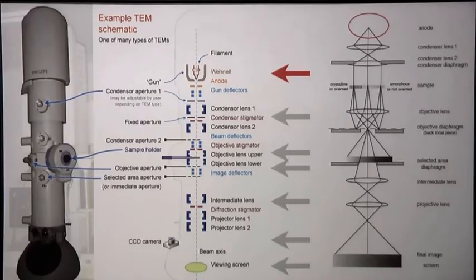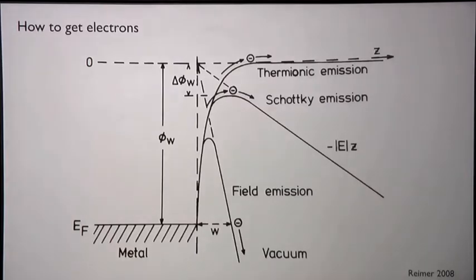So, okay, that brief aside, let's talk about the source. There are really two and a half kinds of sources in an electron microscope. The vocabulary, you talk about three different kinds: field emission, Schottky emission, and thermionic emission. But really, there's a continuum between these three. I'm going to explain each of them in detail. So the thermal emission sources are created by, let me back up a second.